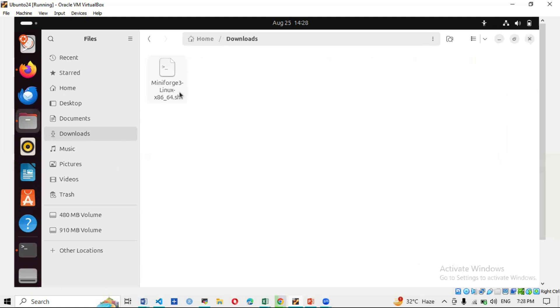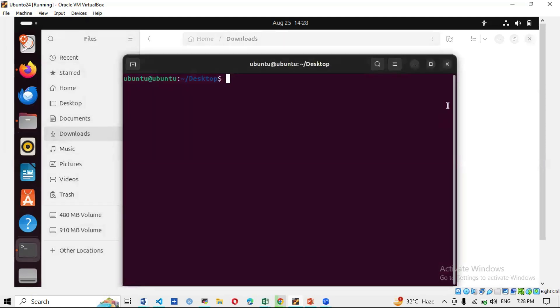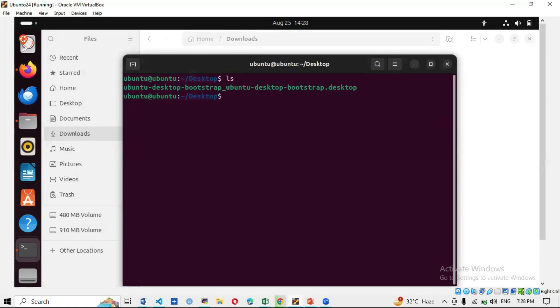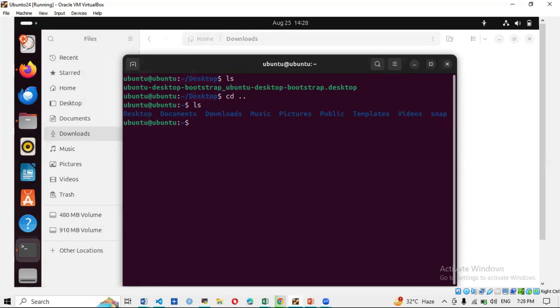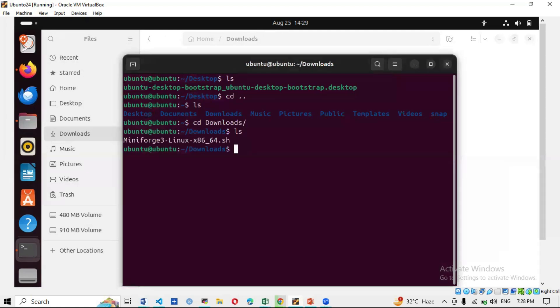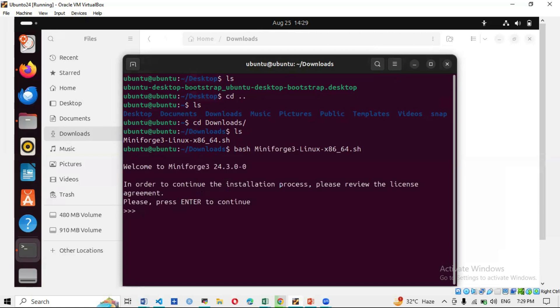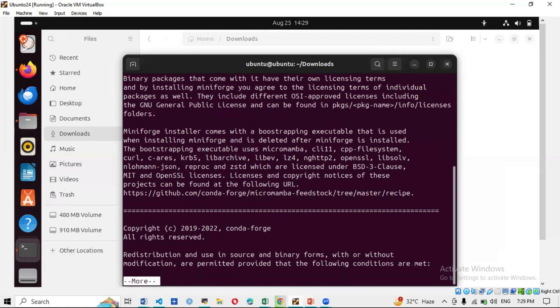In the terminal, navigate to the Downloads folder using 'cd Downloads'. You'll see the Miniforge3 Linux .sh file you downloaded. Then run 'bash Miniforge3...' and press Enter to start installation. When prompted 'Please press Enter to continue,' press Enter and read through the license file by pressing Enter repeatedly.